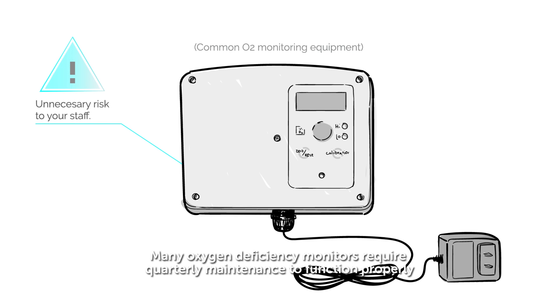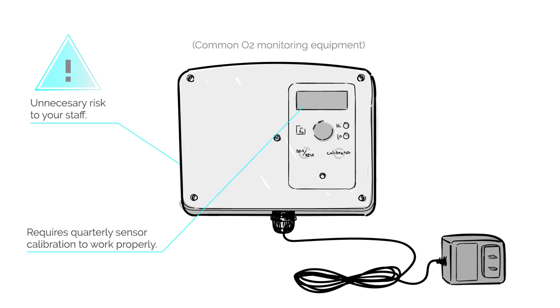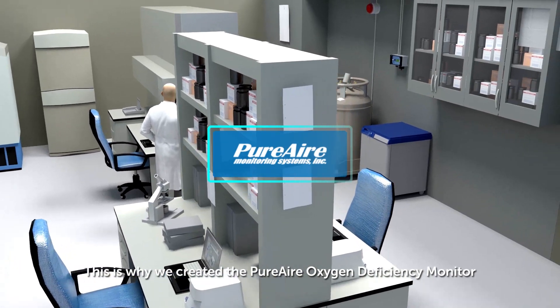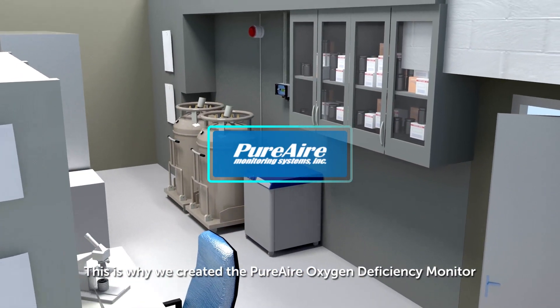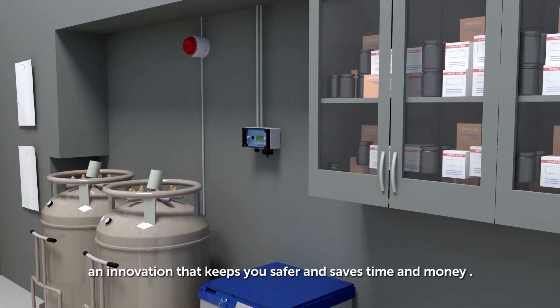Many oxygen deficiency monitors require quarterly maintenance to function properly. This is why we created Pure Air Oxygen Deficiency Monitor, an innovation that keeps you safer and saves time and money.